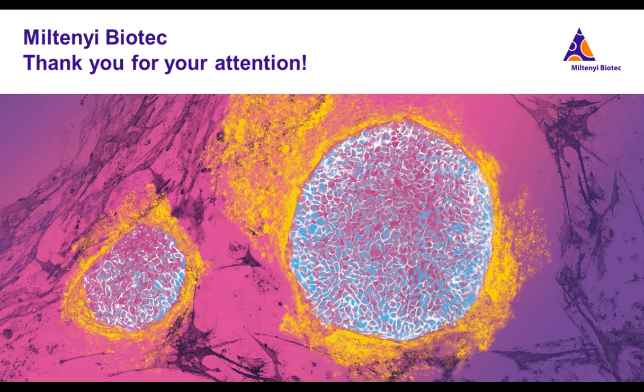Thank you. Now, how do you compensate for autofluorescence? Yeah, so here we have a nice advantage. After or prior to a new cycle, we are acquiring images which we can then use as a background and are subtracted from the marker image. And with this, we can approach the problem of autofluorescence.